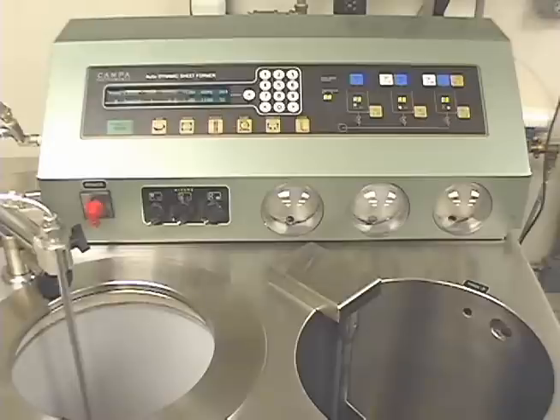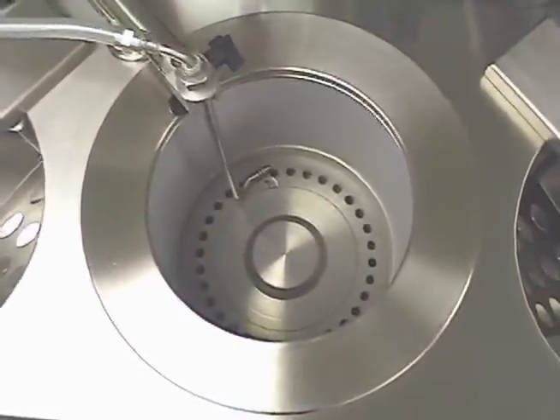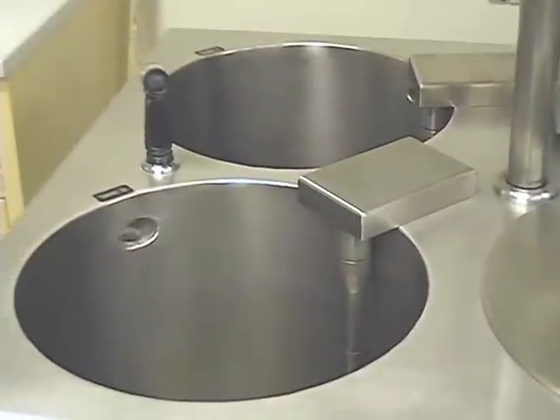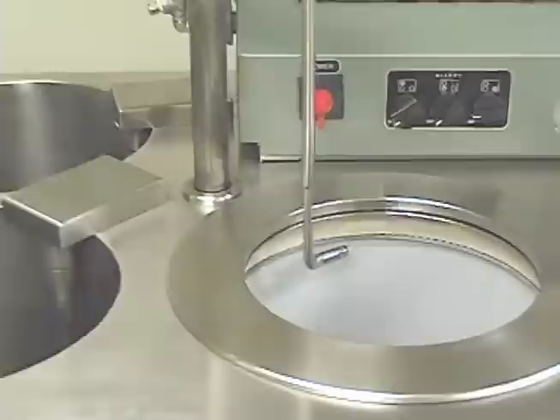The sheets are made in a centrifuge drum with a forming fabric spread about its interior. Multi-layered sheets can be automatically produced from any combination of stocks in the three 50-liter onboard tanks.